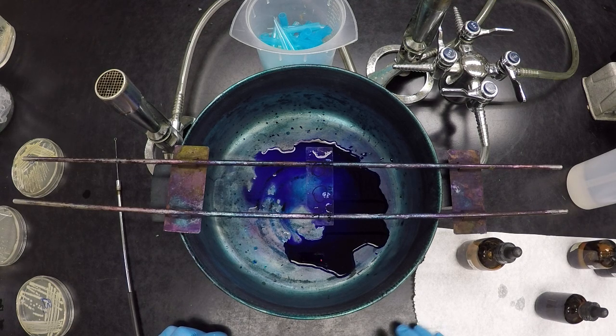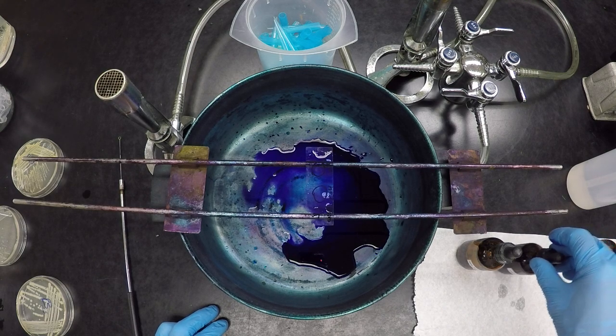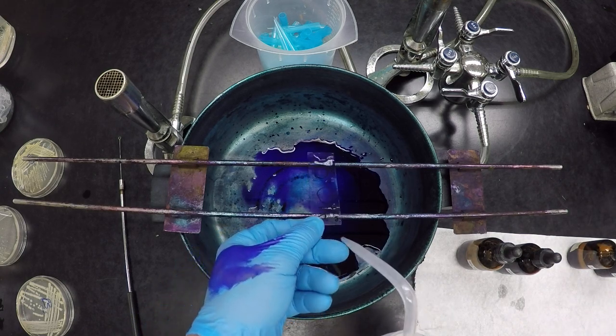Normally you can't overstain these things. You can't leave it on there for too long. So you just let it sit and let the reaction take place. Some say it goes 10 seconds. I usually let it go for about a minute. So let's pretend a minute has elapsed. Just like before, we're going to rinse. All right, so hit it.